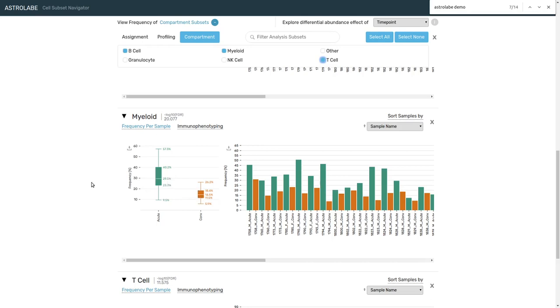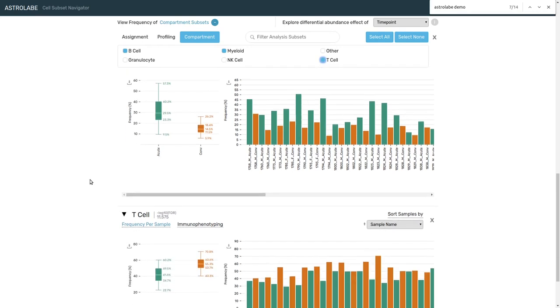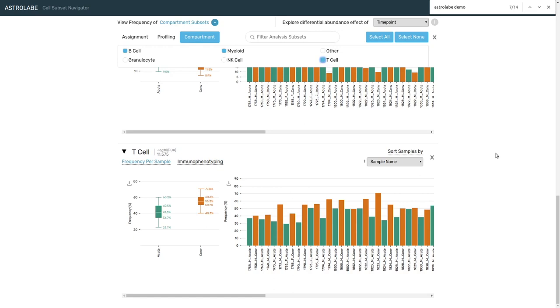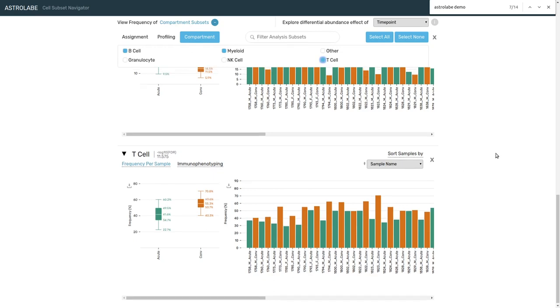And looking at the final compartment, the T cells, we see that there is an increase of about 35% between the two time points, starting at 40% in the acute time point and going up to 55% in the convalescent time point.